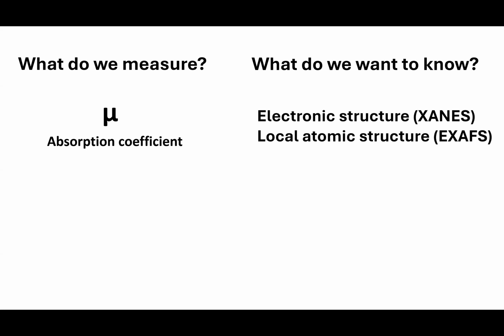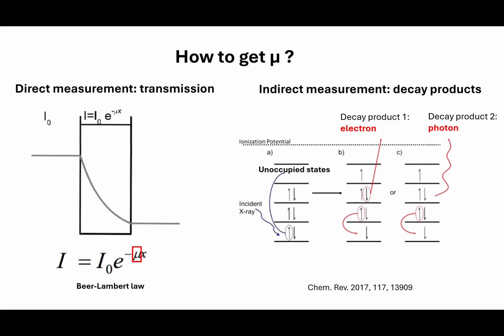We don't really have to care that much about the theories, but if we can measure appropriate standards, that is a very convenient way to help us understand the possible chemical nature of the samples we measure, right? What's happening in the theory and what's happening in the experiments sometimes do not always go hand in hand.